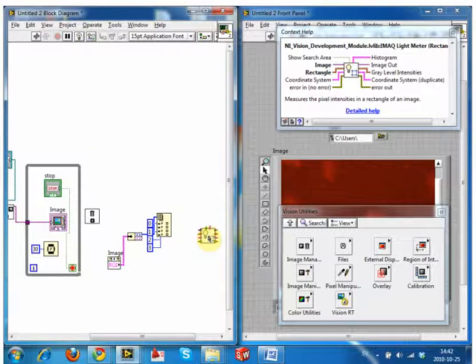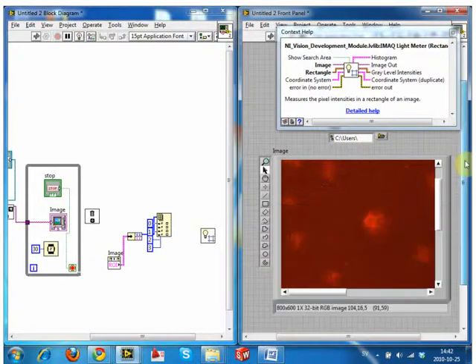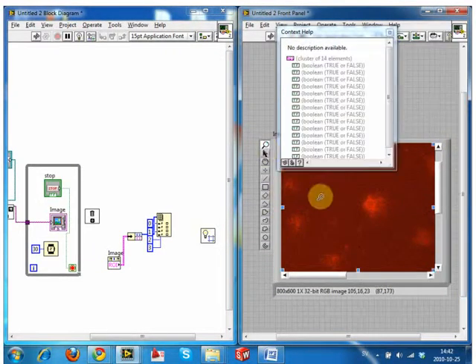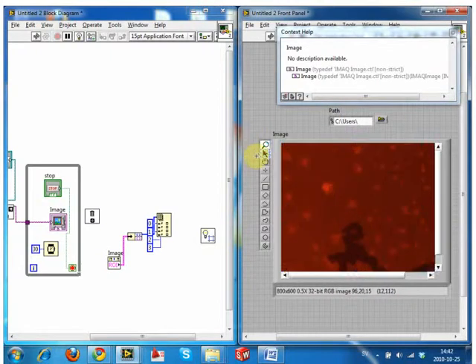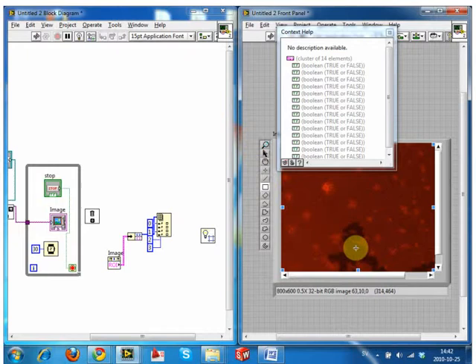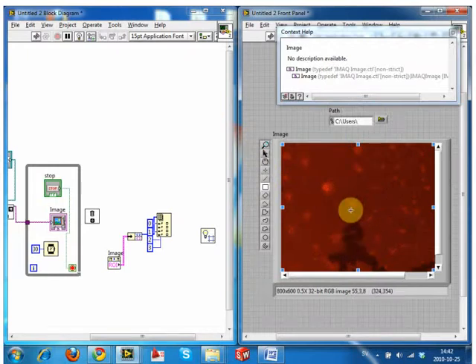So if we're looking at this image, let's say we've got an image stack and maybe this spot is of particular interest, and you want to know if its intensity changes across your image set, if it moves, spreads out, or changes intensity. We want to draw this box over this region and say, tell me how the intensity in that box changes across all of my images.